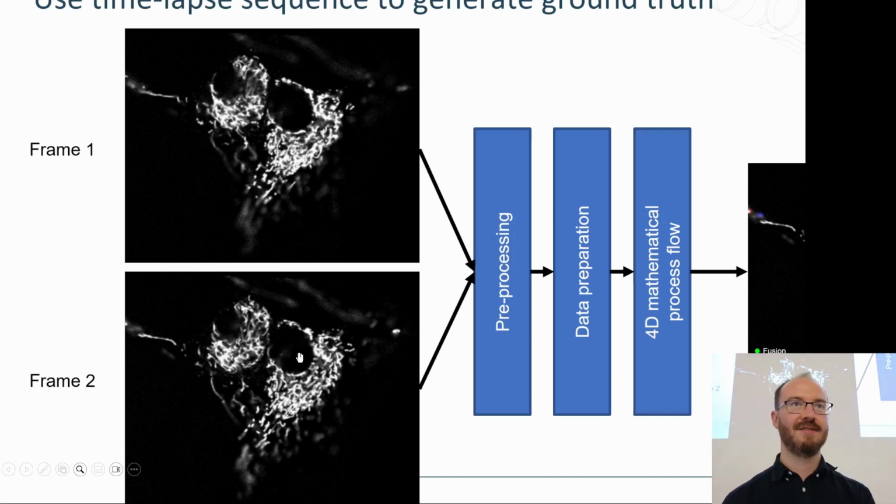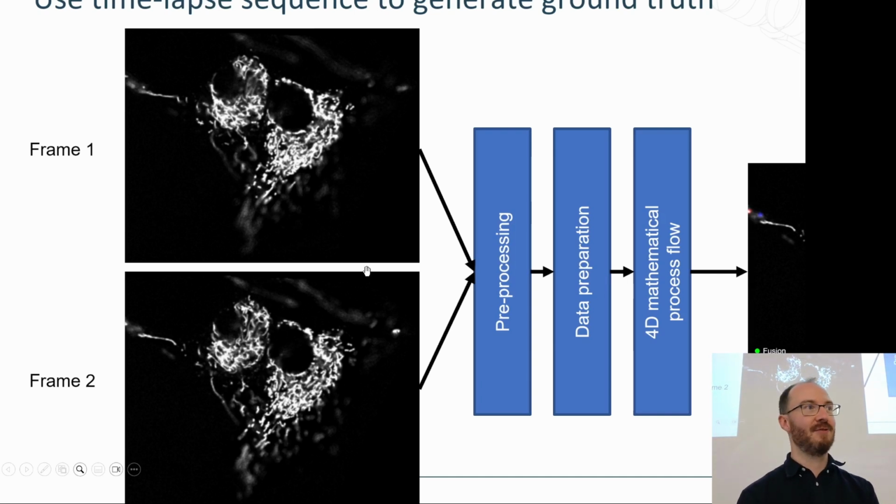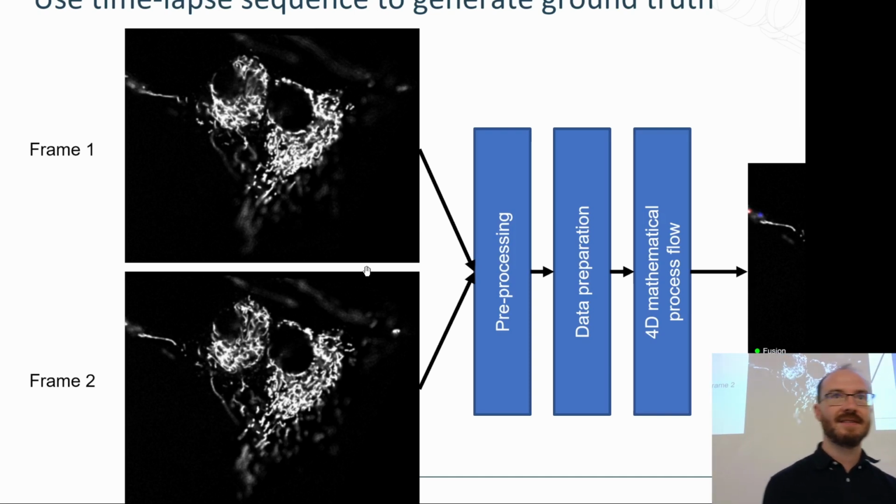What has changed? Structurally, what has changed in my sample? There would obviously be some process flow, but again, how would you do this? How would you even go about solving this? Just think for a moment. Everything that you know, how would I compare 2 frames to then ultimately come to some conclusion? This is where it fused, this is where it fragmented.